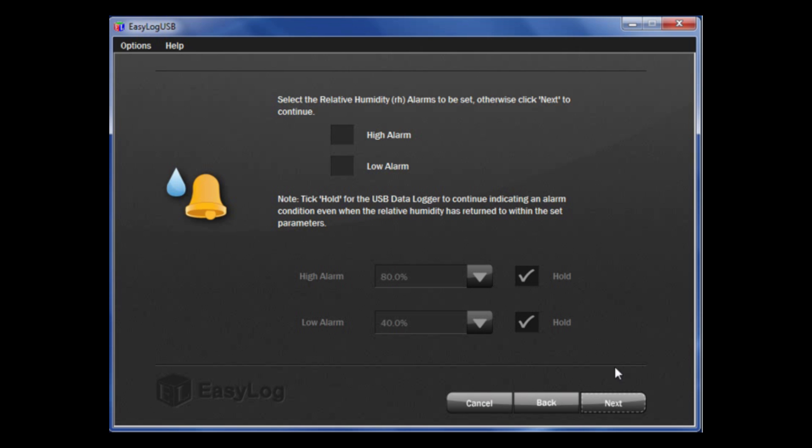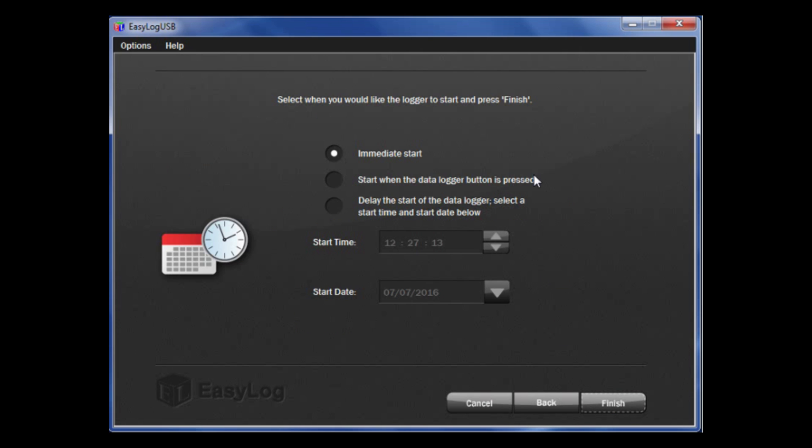Finally, you can set up how you want the data logger to start. You can start with an immediate start, to start when the data logger button is pressed, or select Delay the Start, which allows you to put a set time and date that you want the data logger to begin recording.